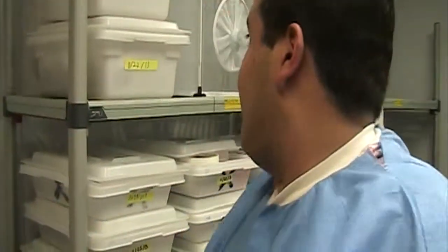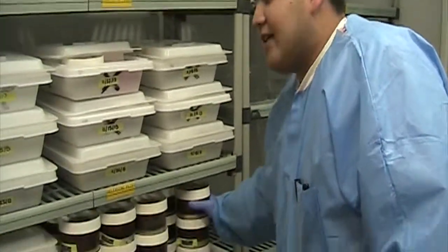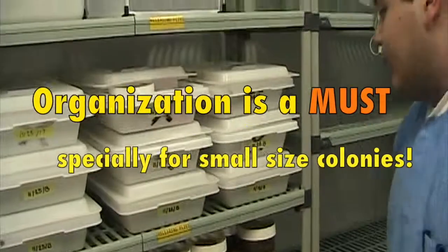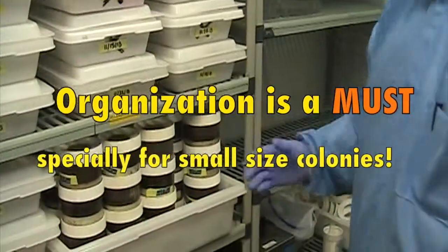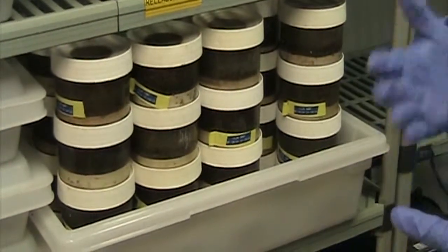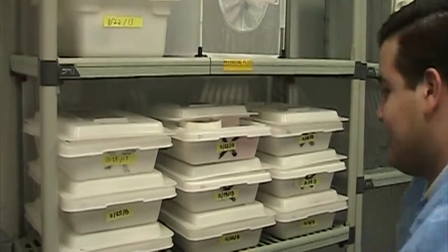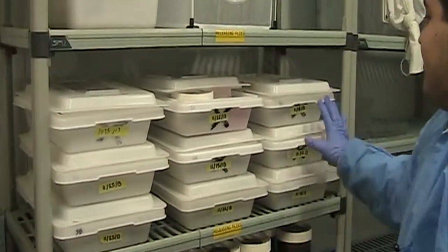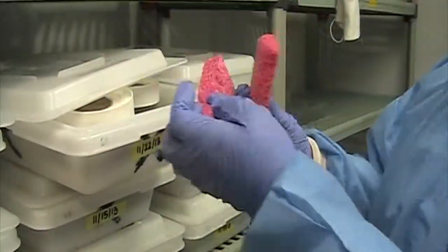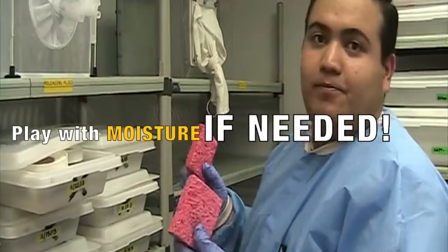The next thing I want to explain is the organization of the bins — why some pods are outside with no top or lid, and some are closed. Our organization keeps the oldest pods, the ones that have been there the longest, outside. These are pods that have very little flies or give no flies at all — they need the least maintenance possible. We work through them in a snake pattern: going from here, here, then here, and so on. Each bin has two sponges, and we keep them with humidity closed. Just remember: these bins that are releasing are the same as the ones inside the incubator — both must have two sponges each.